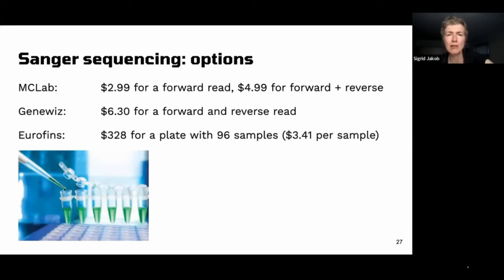So those are the costs of sequencing. As you can see, it's a lot less than if you send it out to Alva Lab or one of the other vendors. And the turnaround time: if I'm in the woods on Sunday, I do DNA sequencing Sunday evening, pop it in the mail on Monday, and I get my sequence results back usually first thing Thursday morning. So it basically takes about 4 days to get the results, which is nice because everything's still fresh in your mind. The samples are still in the fridge. You can do some microscopy on it. So it's actually pretty nifty to have that quick.